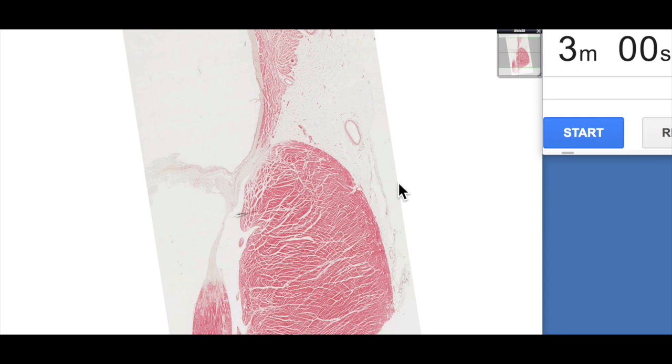G'day everyone, Jamie Chapman here for another episode of 3 Minute Histology. In this video we're going to be having a look at a section of the heart and this is really quite an amazing section.